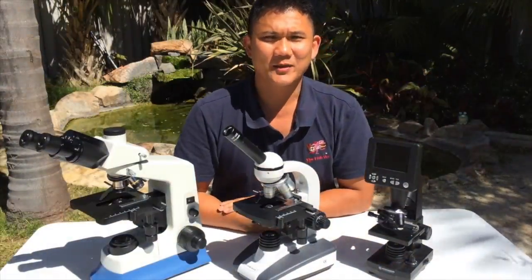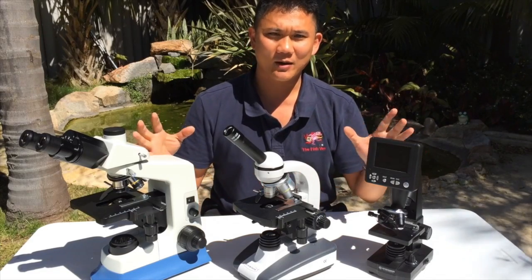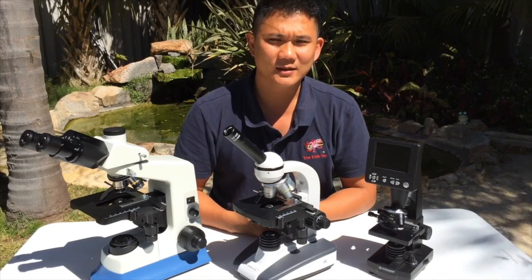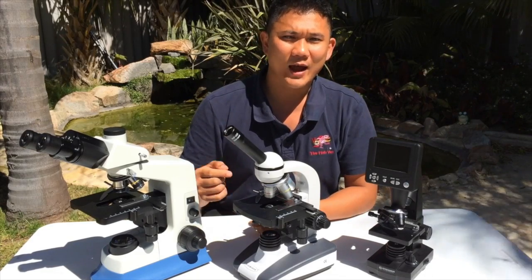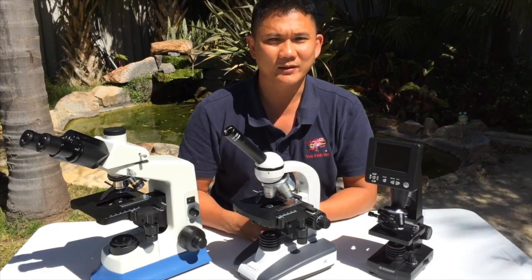Hi, my name is Dr. Richmond Lowe and I'm the fish vet. Today we're going to talk about microscopes for the fish hobbyist. We're going to show you how to select one, how to use it, and what to search for when you're examining fish.